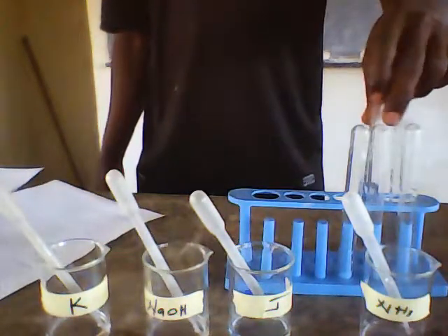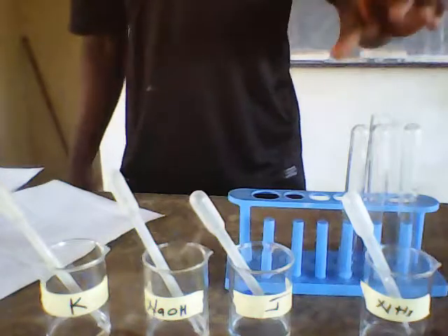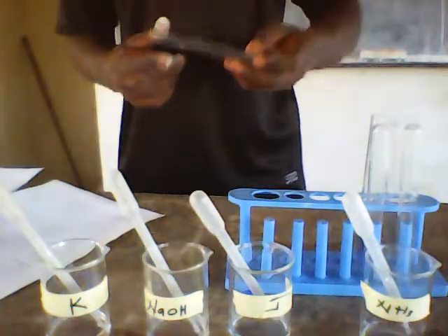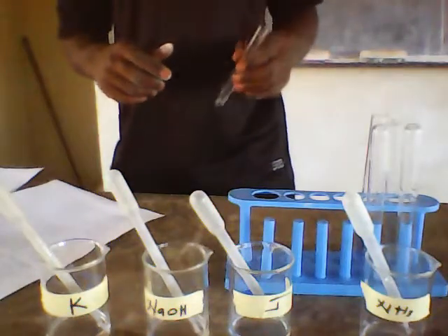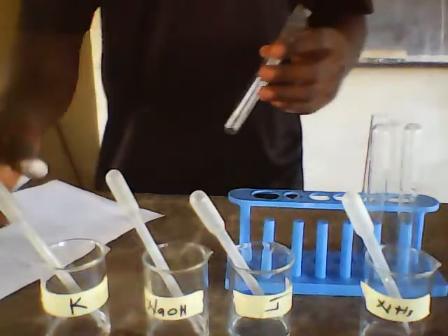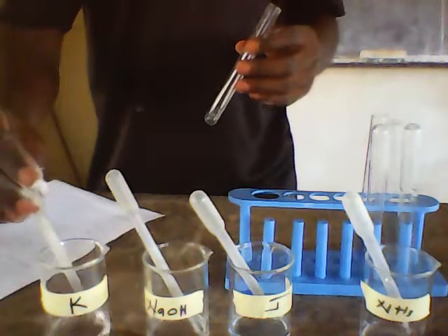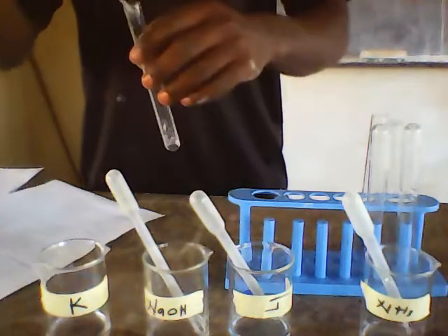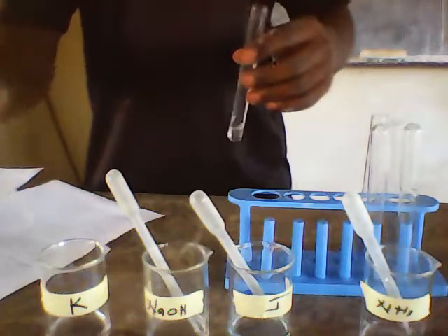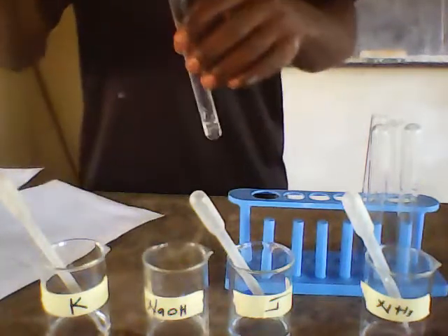So for solution K, done. Then I'll go to solution J. For solution J, I'm done. Then I'll go to solution K. So for solution K, I'm going to add a small portion of solution K into the test tube. Then I'm going to add a small portion of sodium hydroxide.